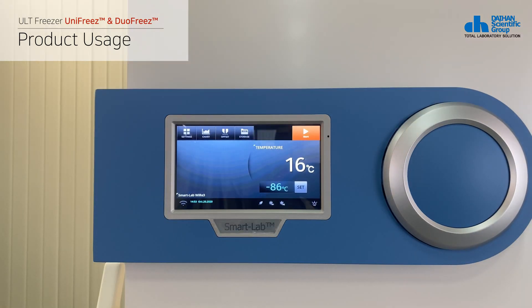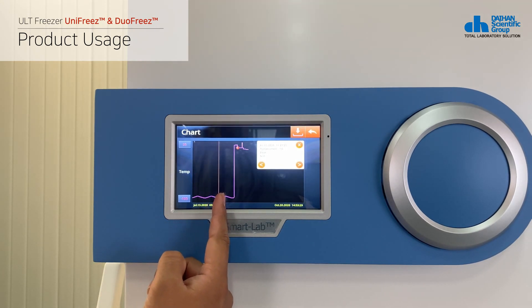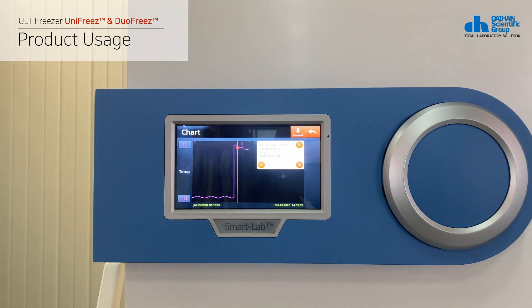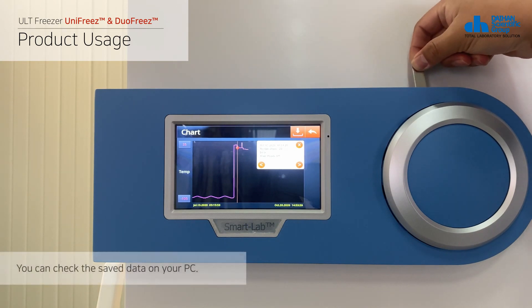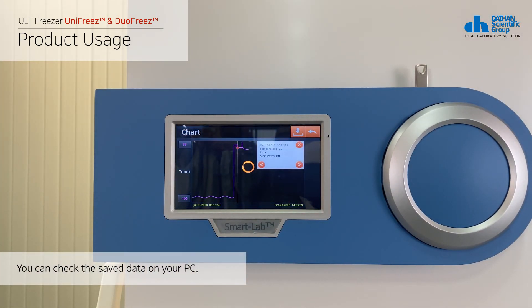Here's how to check the chart. If you click the chart button on the top, you can check the operation status of the product by time in graph form. You can also check the error message by clicking on the part where the error occurred. After inserting the USB storage device, click the save button at the top to save the temperature value.